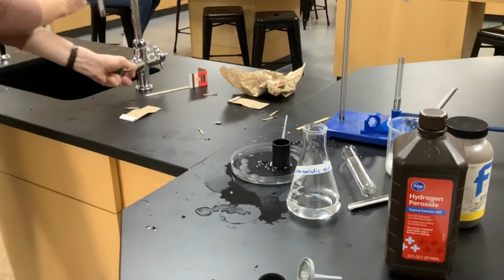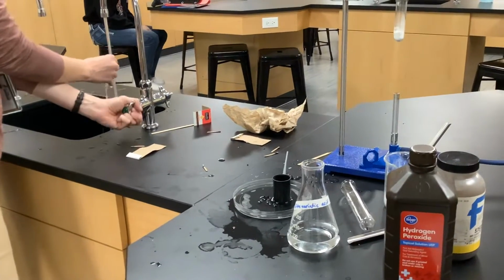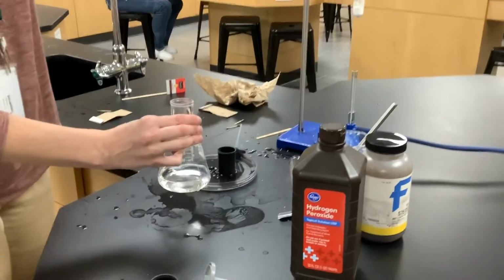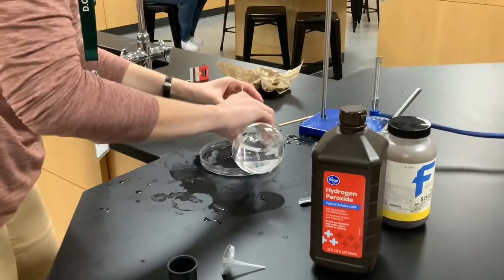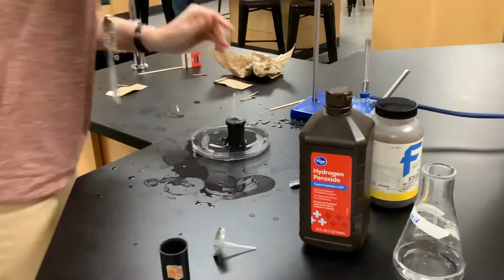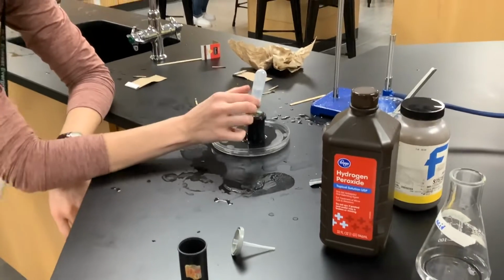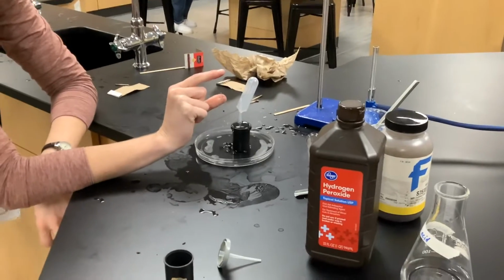I'm gonna fill this totally with water so we know when we've got the hydrogen gas. It's gonna displace the water as it produces that. Can anyone here hold that? Are you okay with that? Okay. Okay. So we should be able to see bubbles here. Look at that right away. So that's hydrogen gas being produced. It's displacing the water in the pipette bulb. And now this pipette bulb is filled with hydrogen gas.